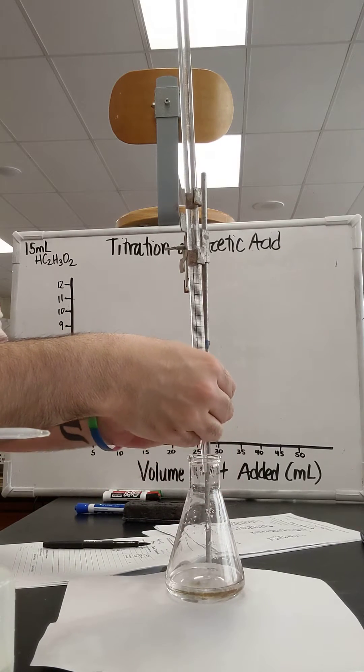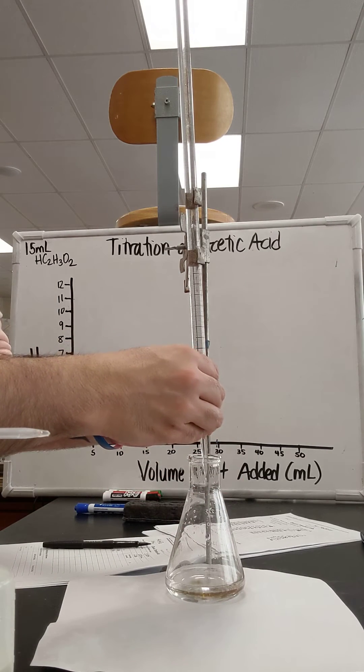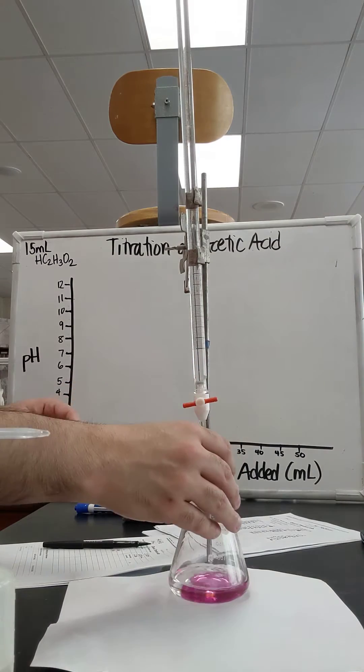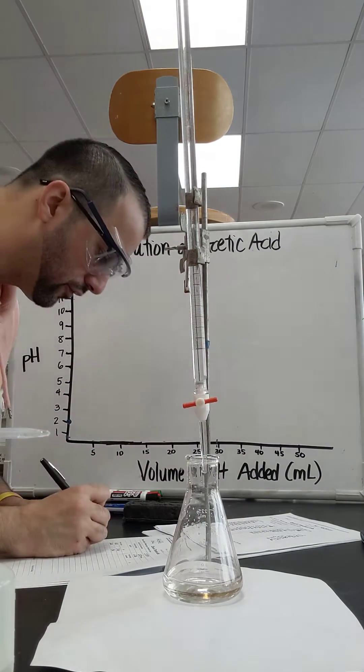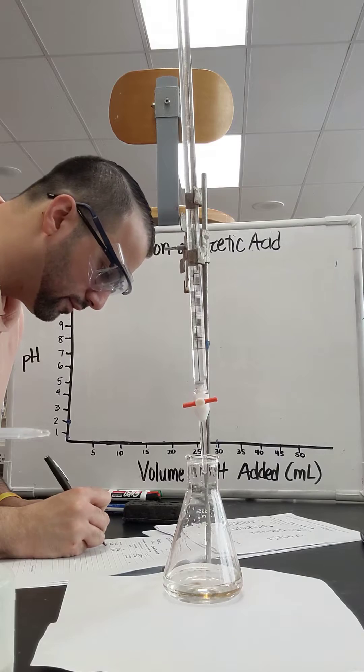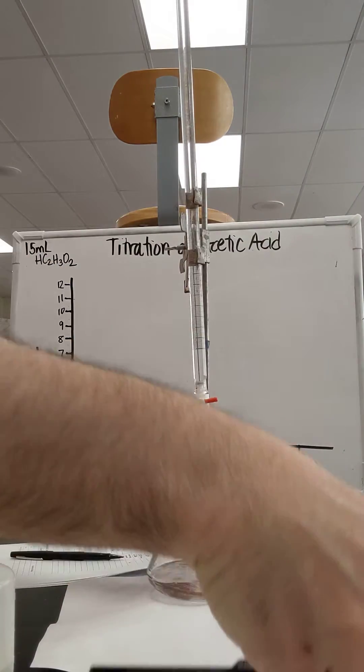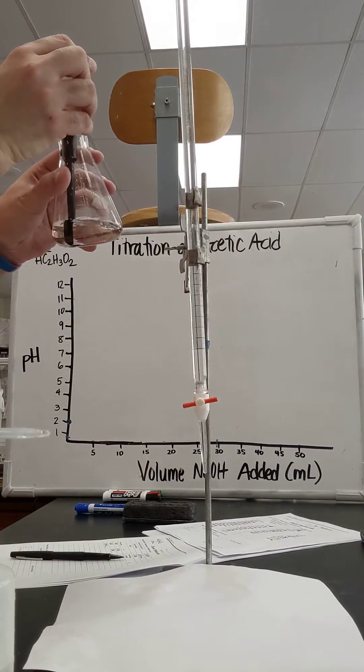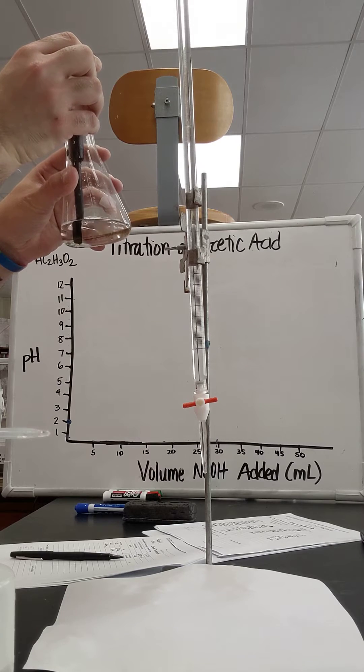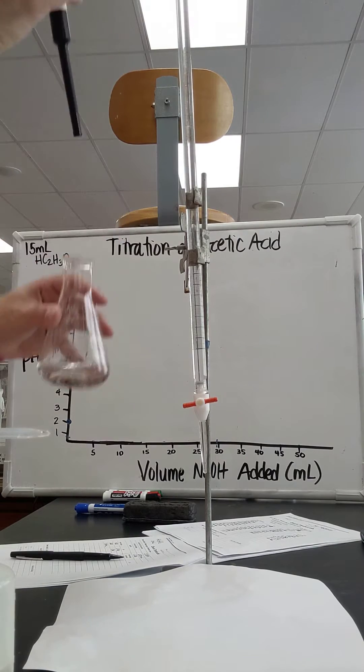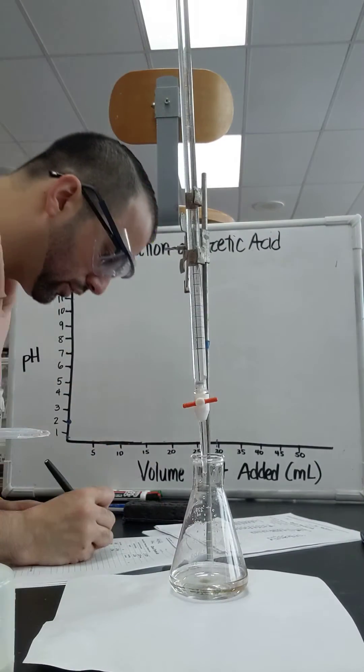Since it jumps so much, I'm going to do another 0.5 milliliters. So I got another 0.5 milliliters in there, that's 2.5 milliliters. And if I quickly record the pH, pH is about 4.13.